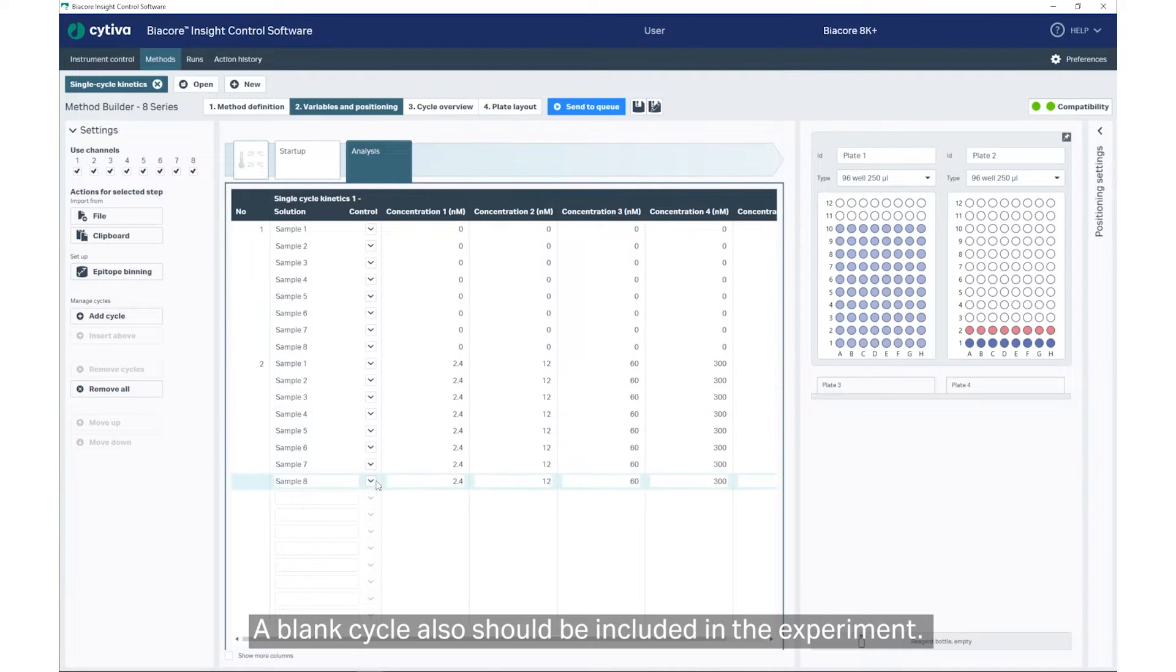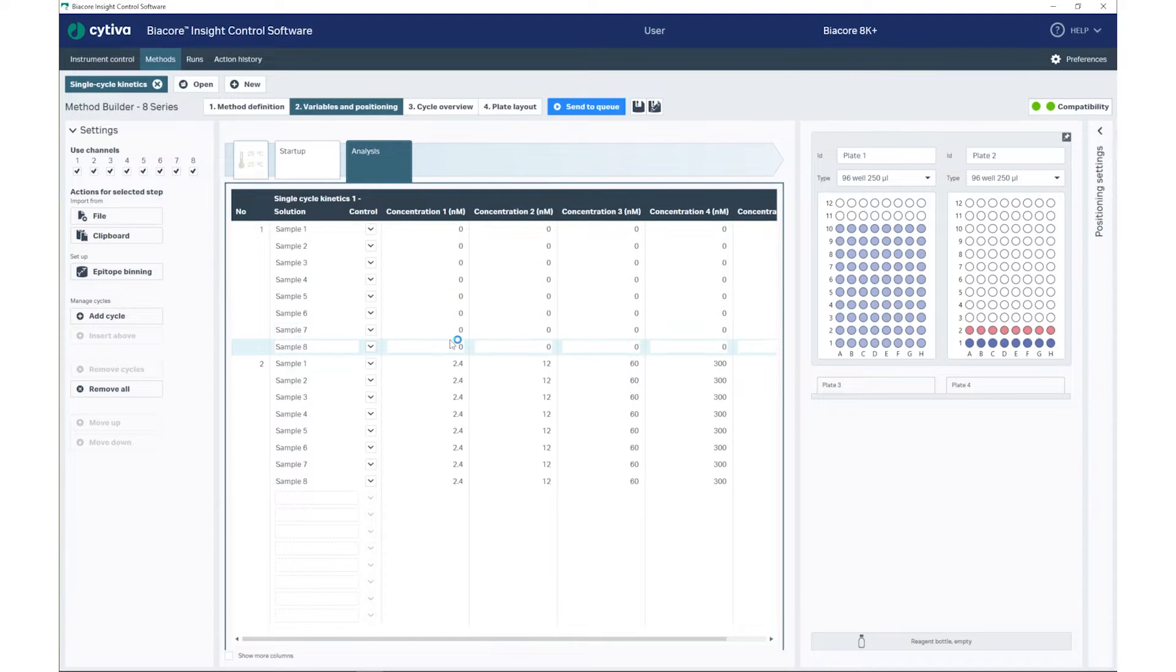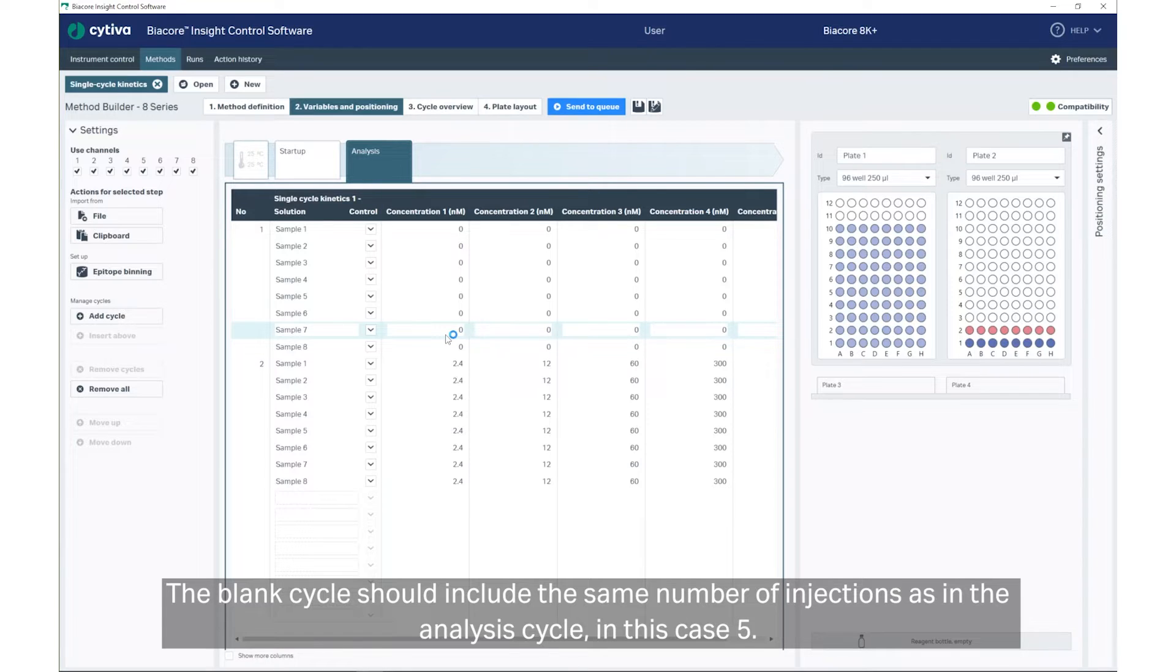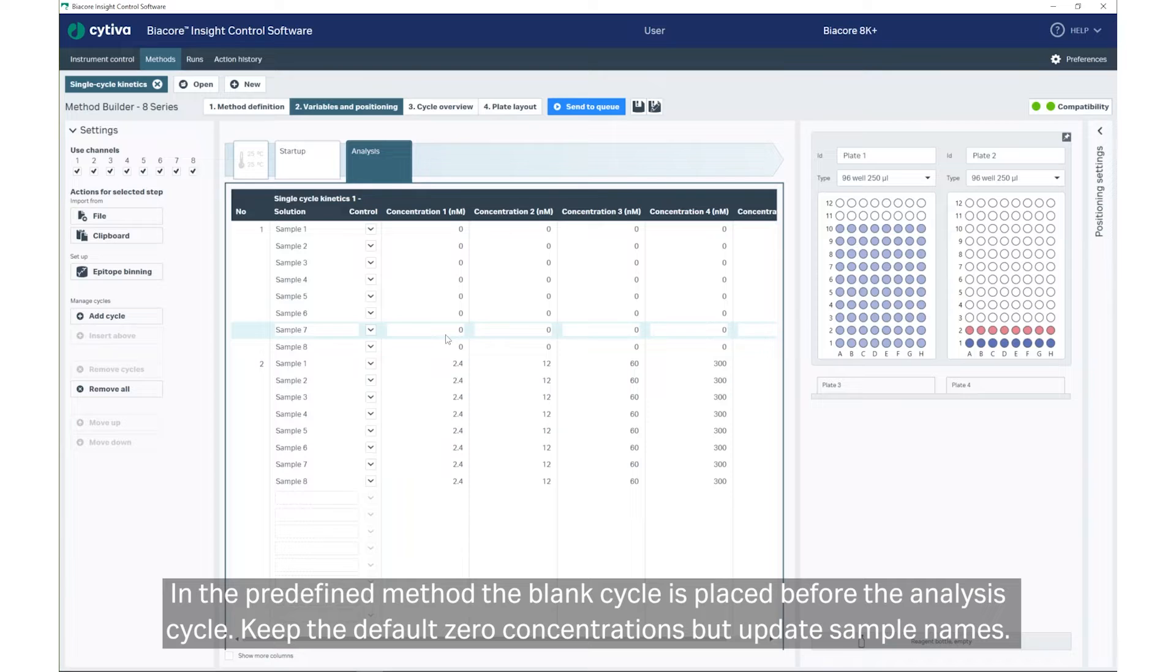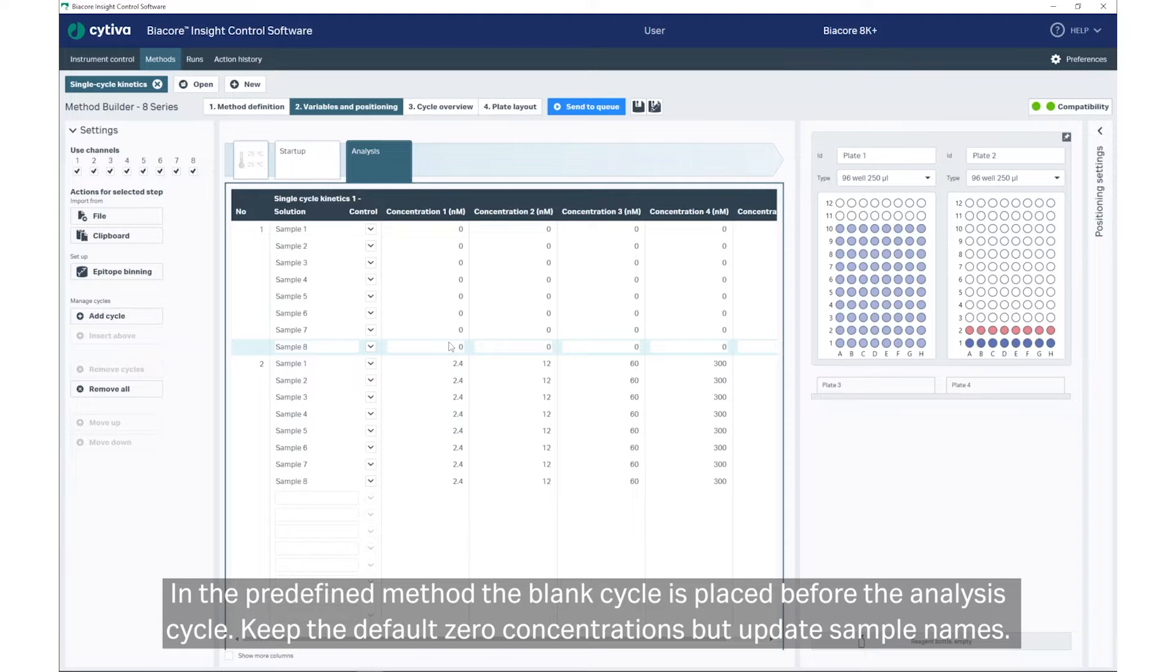A blank cycle should also be included in the experiment. The blank cycle should include the same number of injections as in the Analysis cycle. In this case, 5. In the predefined method, the blank cycle is placed before the Analysis cycle. Keep the default zero concentrations, but update sample names.